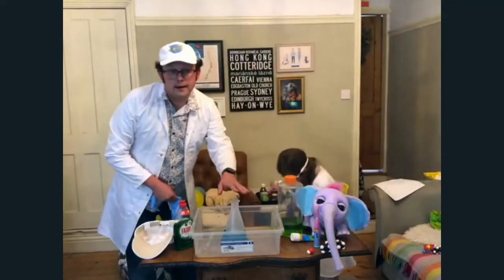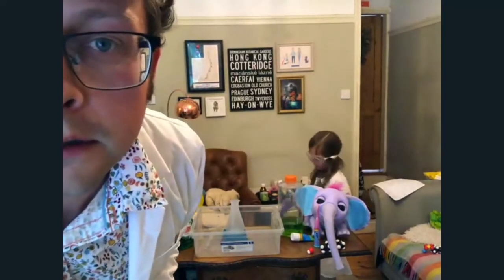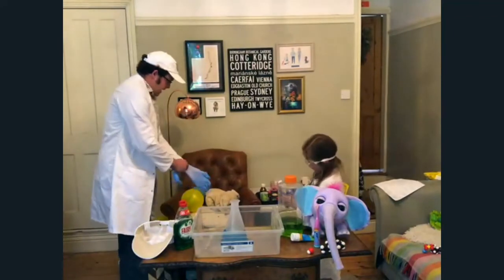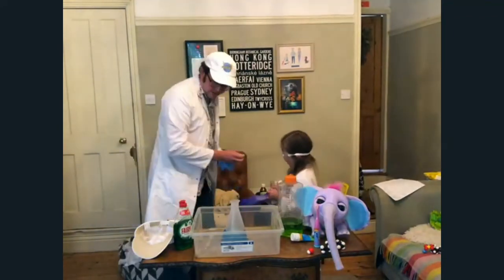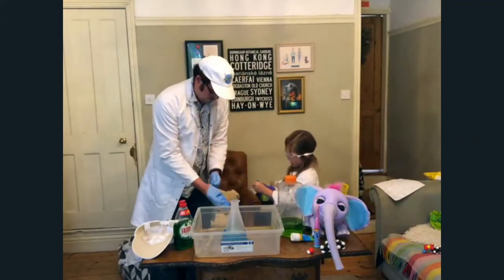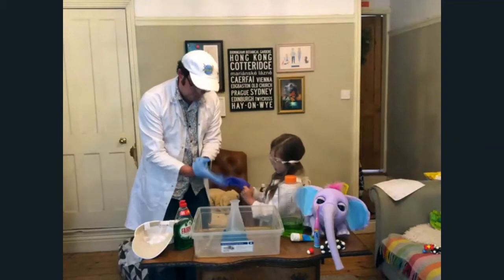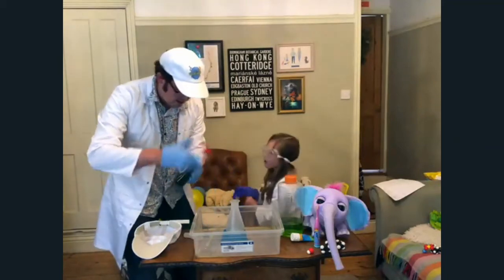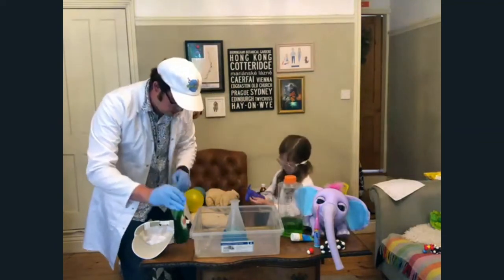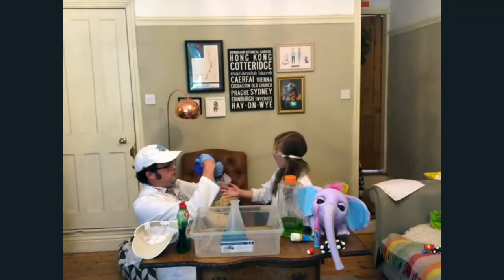Hopefully everyone can see that conical flask, all right? So what we're going to be putting in here is a bit of fairy liquid. So shall I put that in? You're right there, Beth. Well, that gives me finger protection in there. So put a little bit of that in. Oh, sorry, you put that upside down, sweetie.